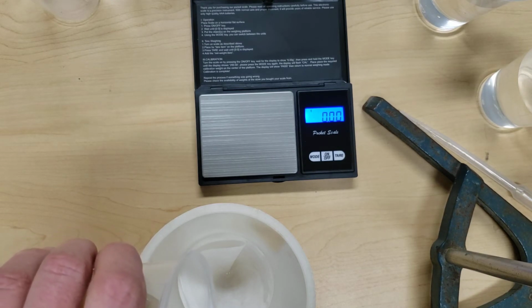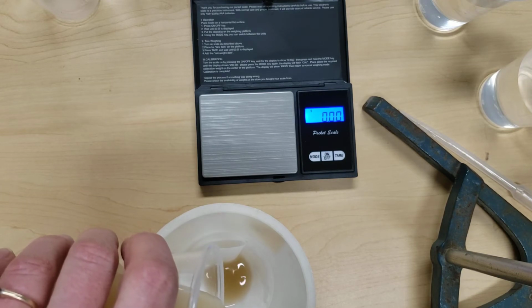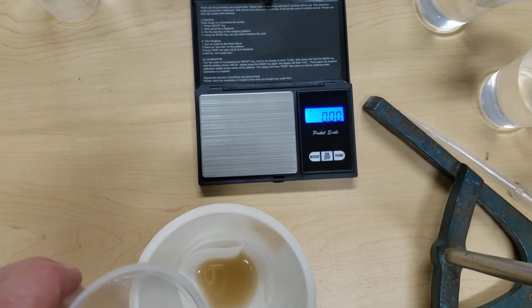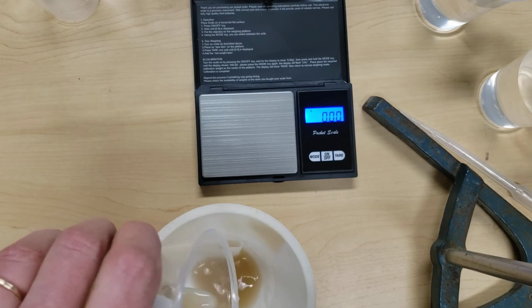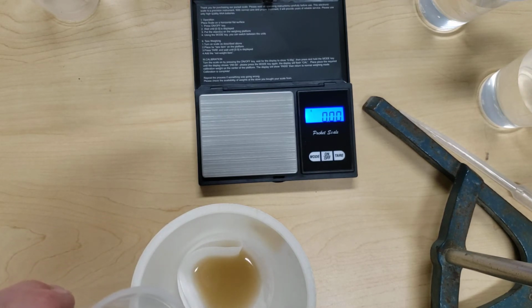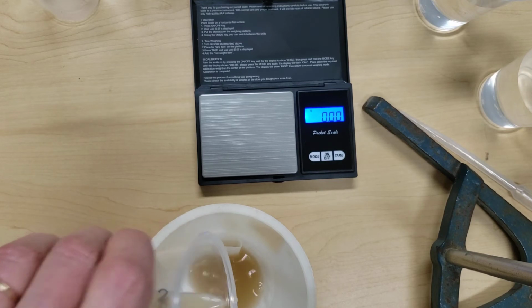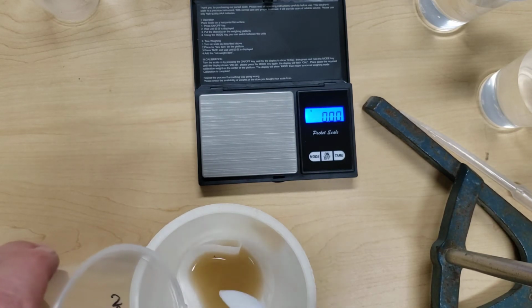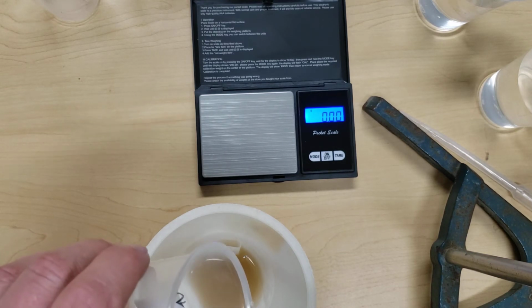So we want to pour the liquid into the funnel, and it'll filter much faster if you do the liquid first before transferring the solid. You'll let it filter through until you have removed all of the liquid from the solid. Then you can transfer the sand down into the filter paper as well.